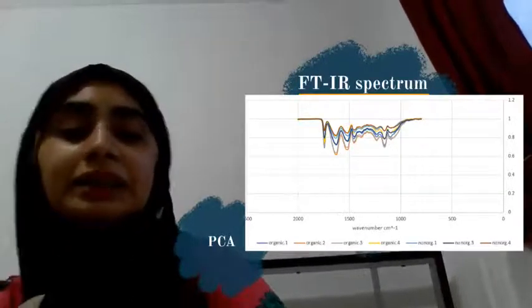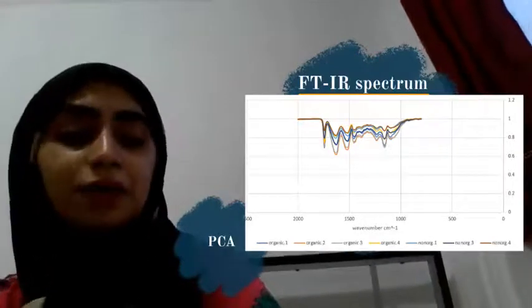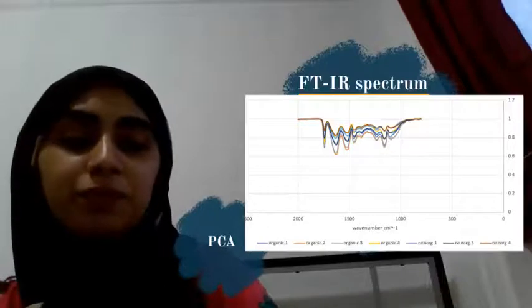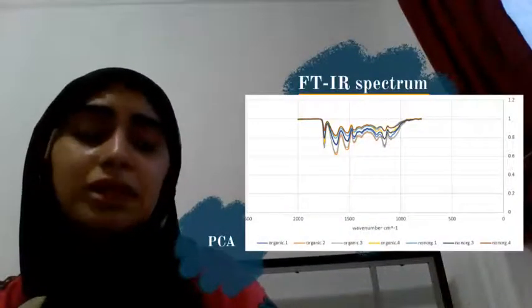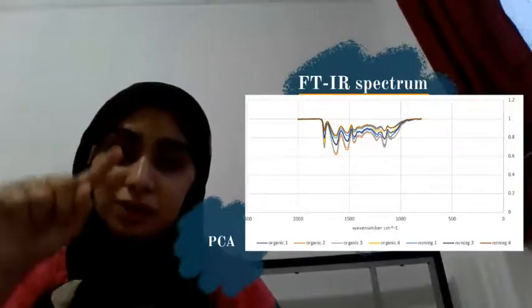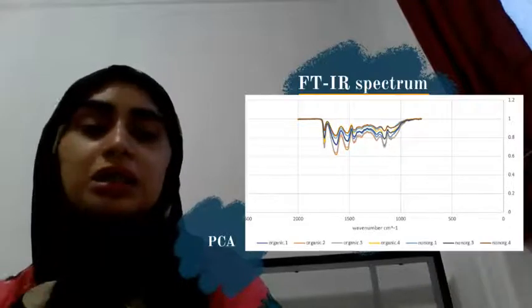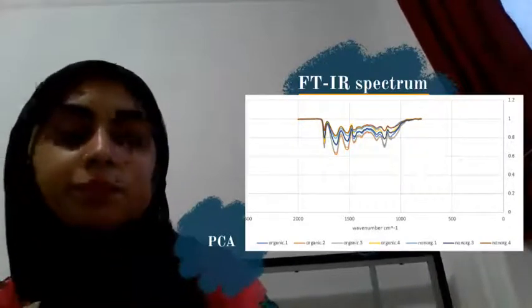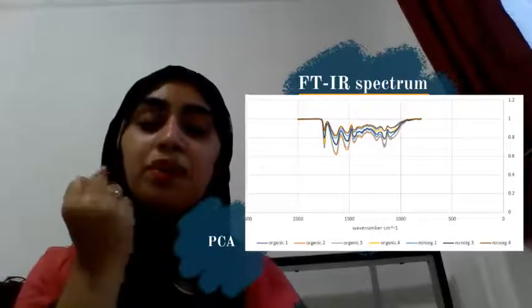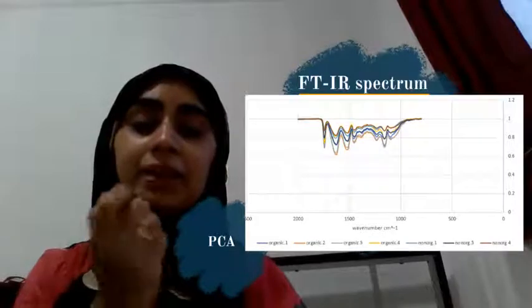Moreover, the peaks are very intense, meaning much more up and down, due to my samples being dry, which leads to a greater sensitivity and noise to signal ratio. In general, in this spectrum, we see that the organic samples are much more intense, meaning much more down, than the conventional ones, except the dark blue sample number 3. This may be linking back to what I mentioned earlier about a conventional sample being very hard. It was very hard to grind it.